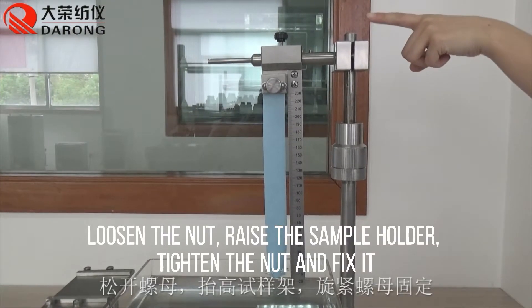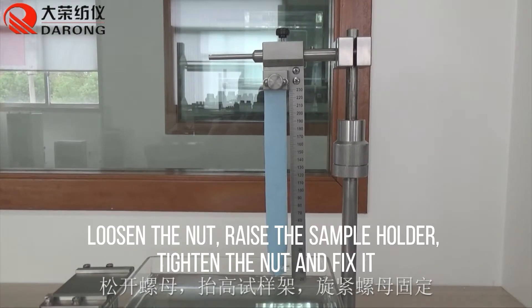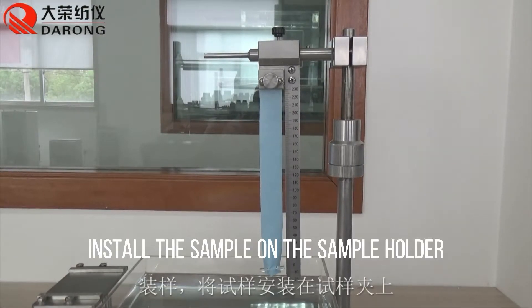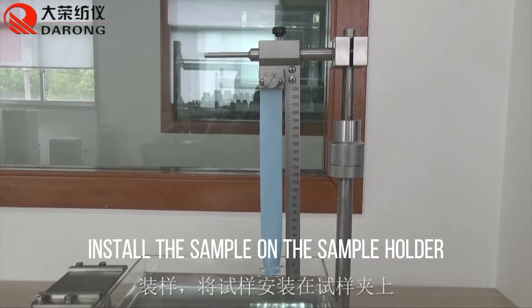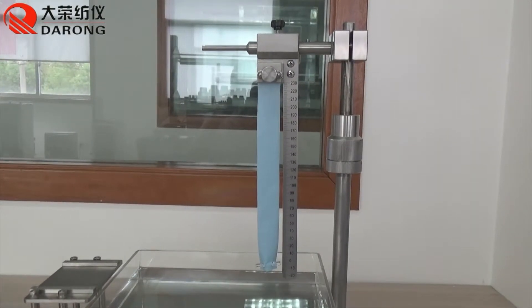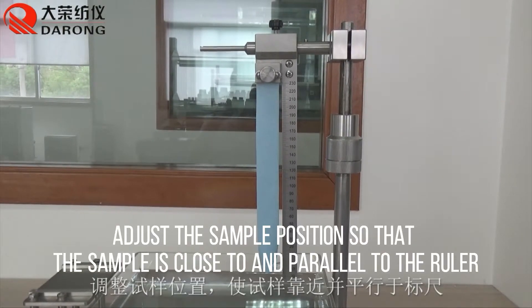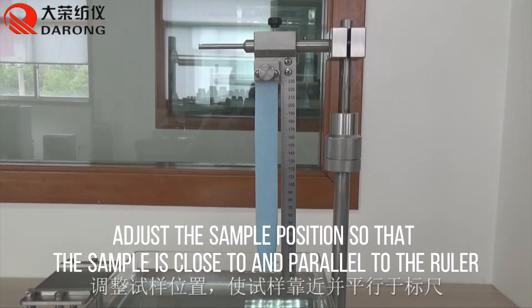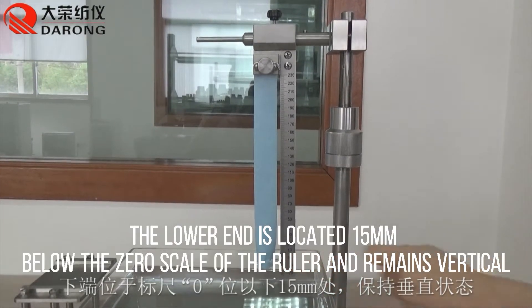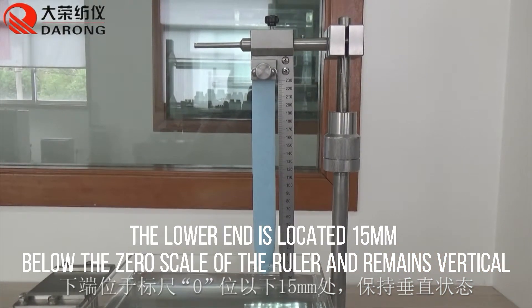Loosen the nut, raise the sample holder, then tighten the nut to fix it. Install the sample on the sample holder. Adjust the sample position so that the sample is close to and parallel to the ruler, with the lower end located below the zero scale of the ruler, remaining vertical.